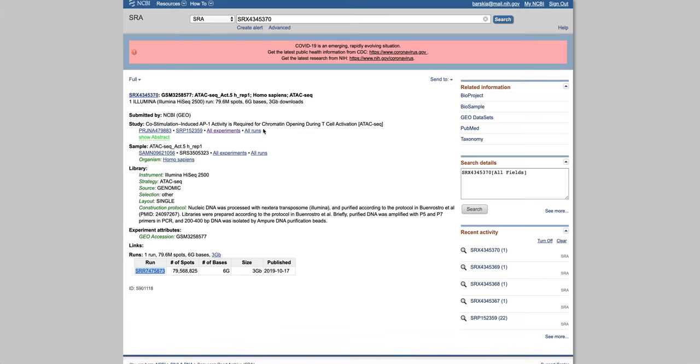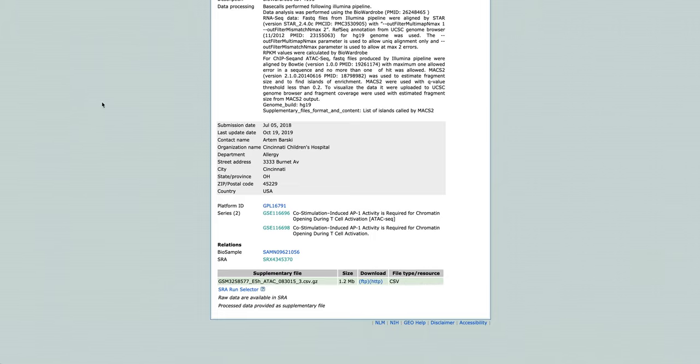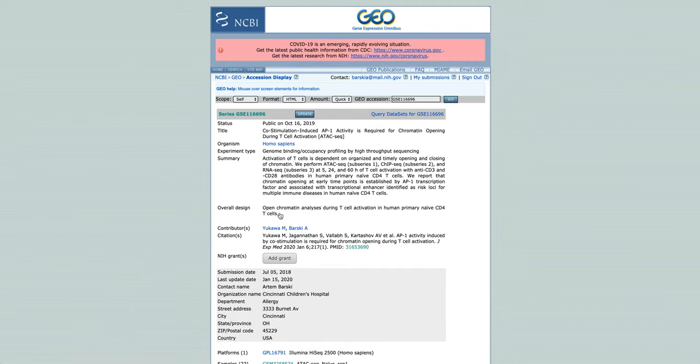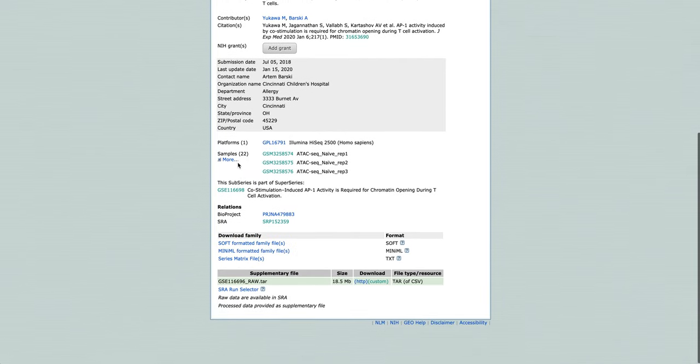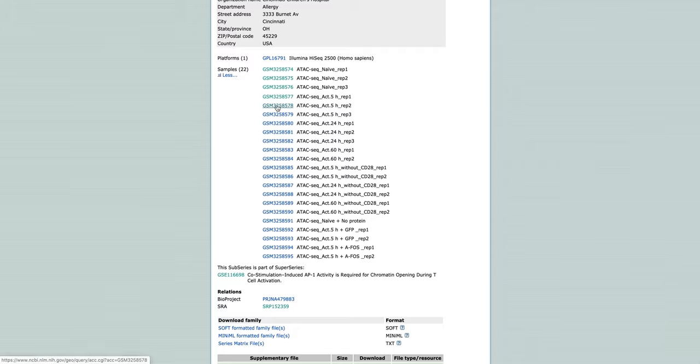Here you can see the experiments. We want to use ATAC-seq data from this series, and we want to take the experiment that is called ATAC-seq activated 5 hours replicate 2.